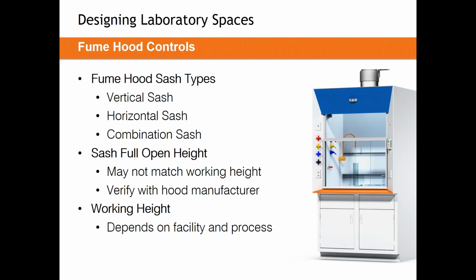Meaning you might have a caution alarm going off or an actual true alarm saying you have low velocity and no containment, which is okay for the setup of the hood, but it usually shouldn't be used in the actual operation. To save some energy and to save some equipment costs up front, I really don't recommend designing for that full open position of 24 or 30 inches, unless we know it needs to be used by the people working on that fume hood.